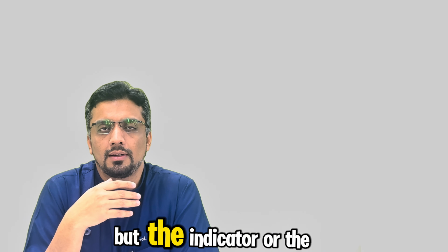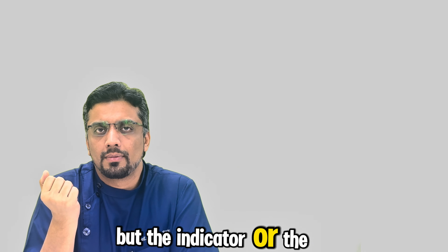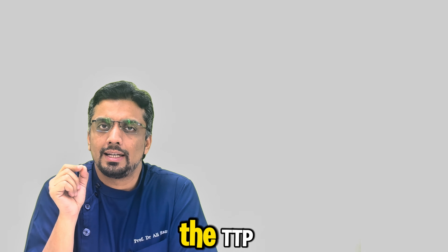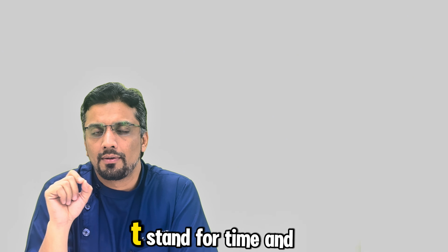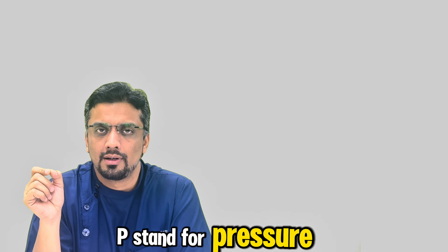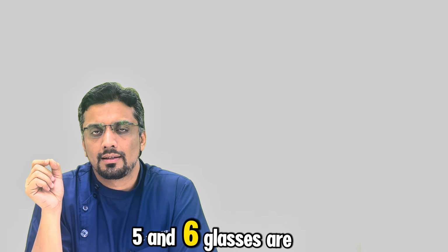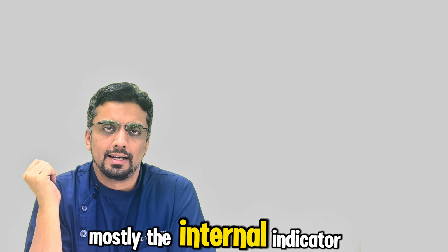But the indicators of class 4, 5 and 6 are more accurate, and they tell us about the TTP. T stands for temperature, T stands for time, and P stands for pressure. They tell us a story that the proper pressure has been applied for a given period of time and the proper time has been applied. These class 4, 5 and 6 are mostly internal indicators. Internal indicators are those which are placed inside the pouches, and external indicators are placed over the pouches to validate the process of sterilization.